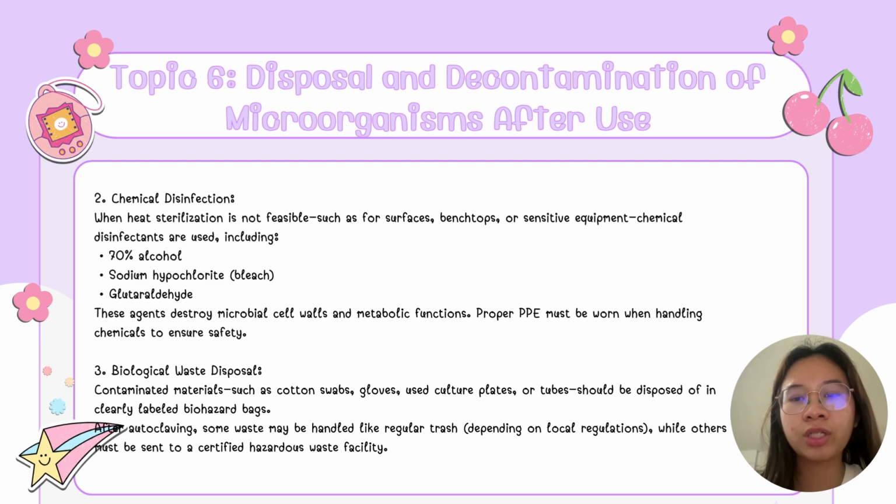Third, biological waste disposal. Contaminated materials such as cotton swabs, gloves, used culture plates, or tubes should be disposed of in clearly labeled biohazard bags. After autoclaving, some waste may be handled like regular trash, while others must be sent to a certified hazardous waste facility.